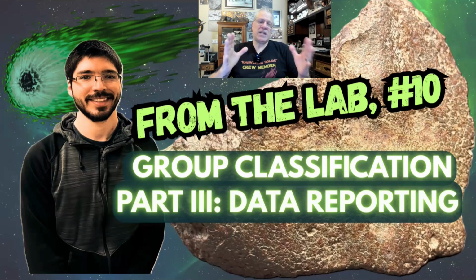So the first one, you remember we were in the lab taking the actual readings. The second episode, we were getting those readings from the software of the SEM into a more portable Excel file. Now we're going to be working with that. We actually cleaned the data. Now we're going to be getting the data in a submission form to the nomenclature committee. So like I said, this has never been done before. I'm absolutely loving it. So Daniel Sheikh, thank you for joining us with this one.